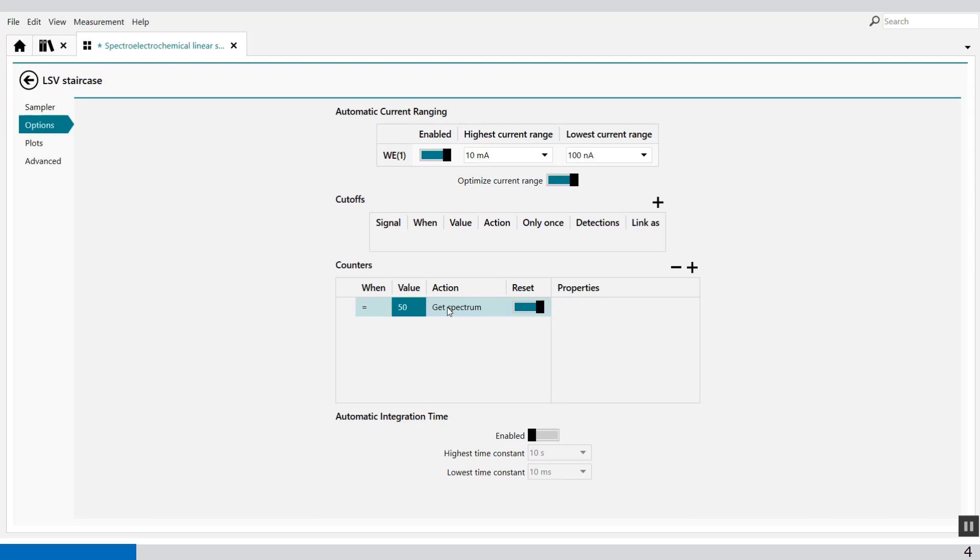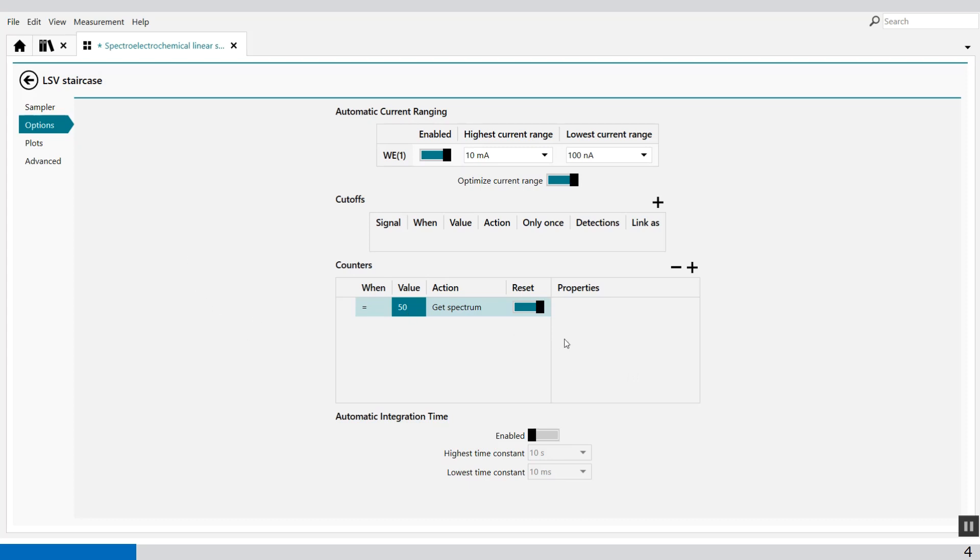And at the end, so 410 divided by 50 is roughly 8 spectra. So we're going to expect 8 spectra after the measurement. Of course you can set this value the way you want and so you can get more spectrum but for the examples we set this to 50.